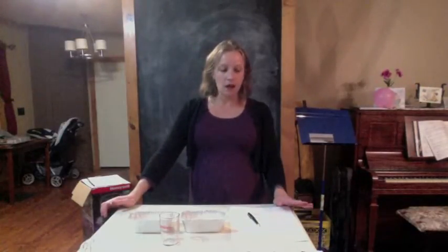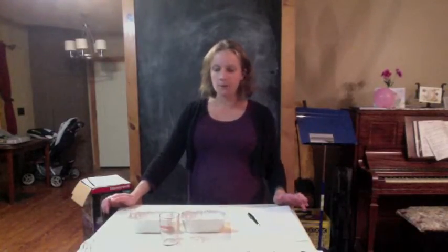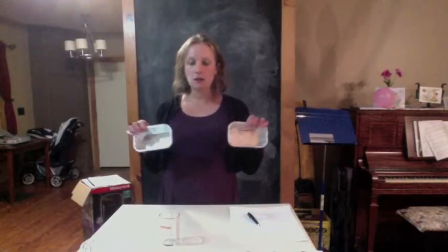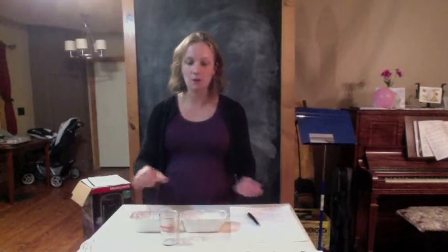So you can think ahead. Do you think a higher temperature would cause a faster reaction rate or a slower reaction rate? We're going to test that. So here I have two containers that are similar to one another. Well, these are identical. If you can find two identical containers, that is great.